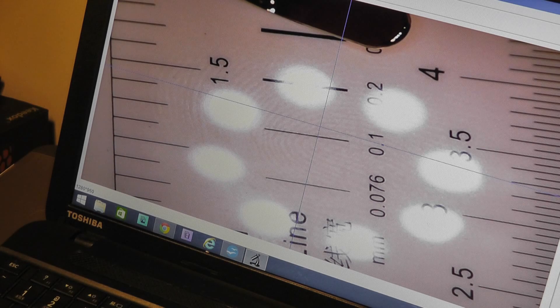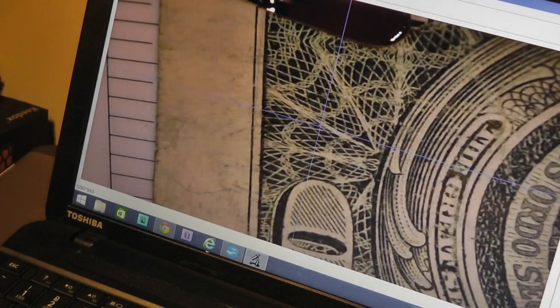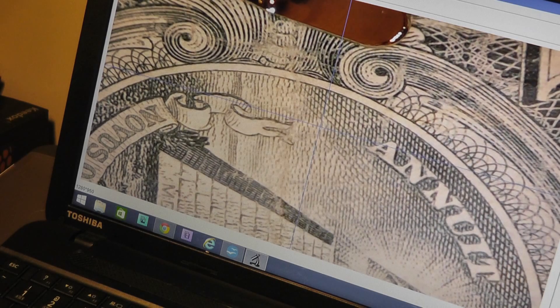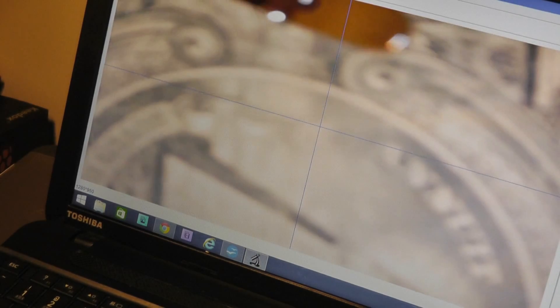We have the slide here — you can see it's pretty easy and rather focused. The lights can be a bit transflective if you have materials that are really glossy. But if I take something else, perhaps a $1 bill, and I wanted to magnify it to see what's inside in terms of the designs, you can get a pretty good read on that. It's pretty impressive in terms of the amount of detail you can get, and I can easily adjust by zooming in or zooming out to get a focus on whatever subject you want.